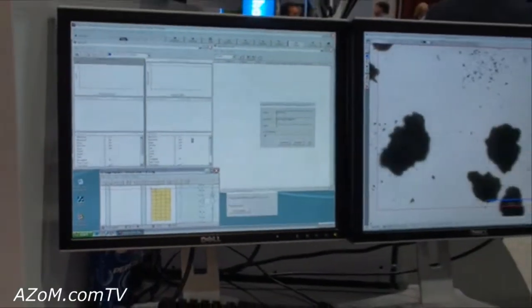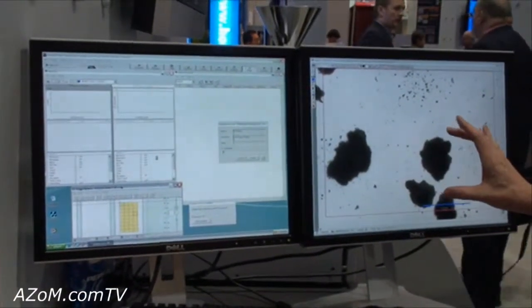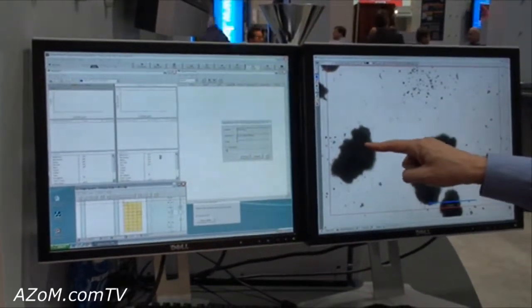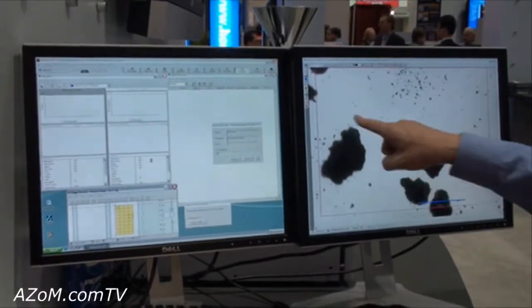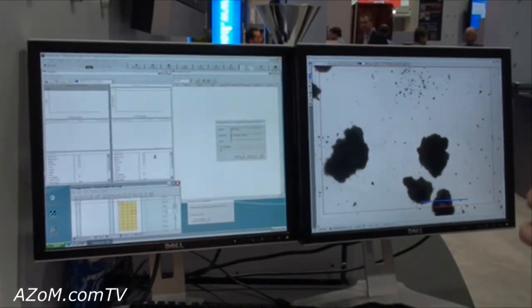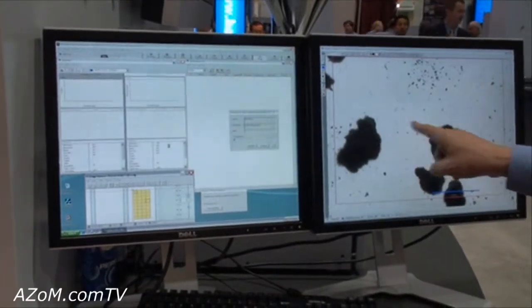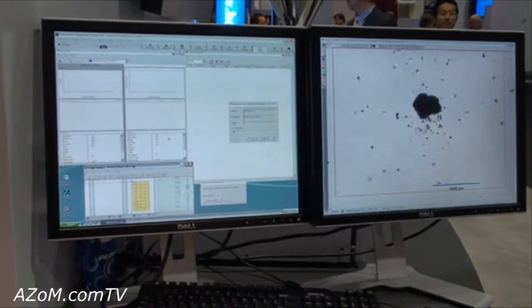As we're doing the measurement, what's going to happen is as it looks at each of these images, as it looks at each field, first it's going to separate the background from the particles. That's the thresholding step. Then we're going to define the edges, perform some basic image analysis functions to improve that image, and then once the image is improved, we'll start performing the analysis and assigning different size and shape values to each of the particles that show up in each field that we measure.